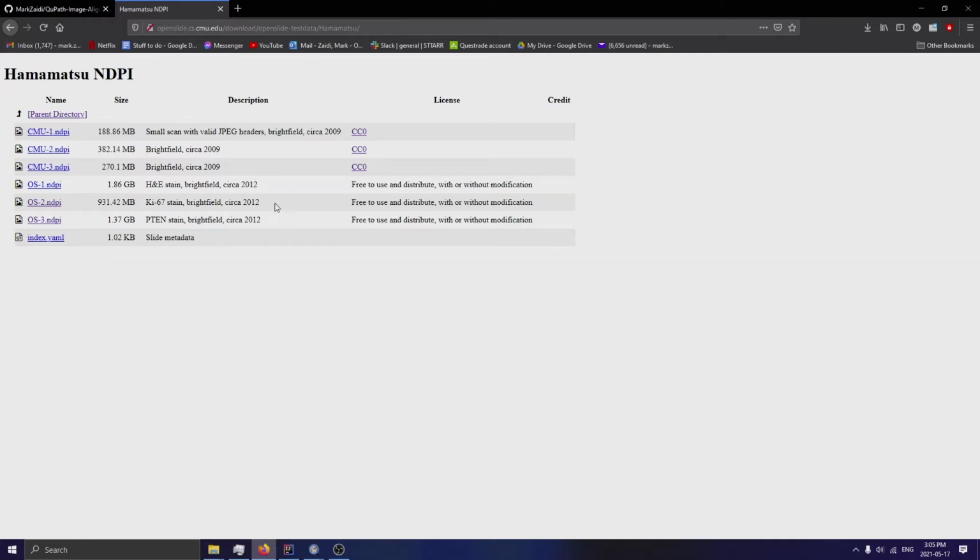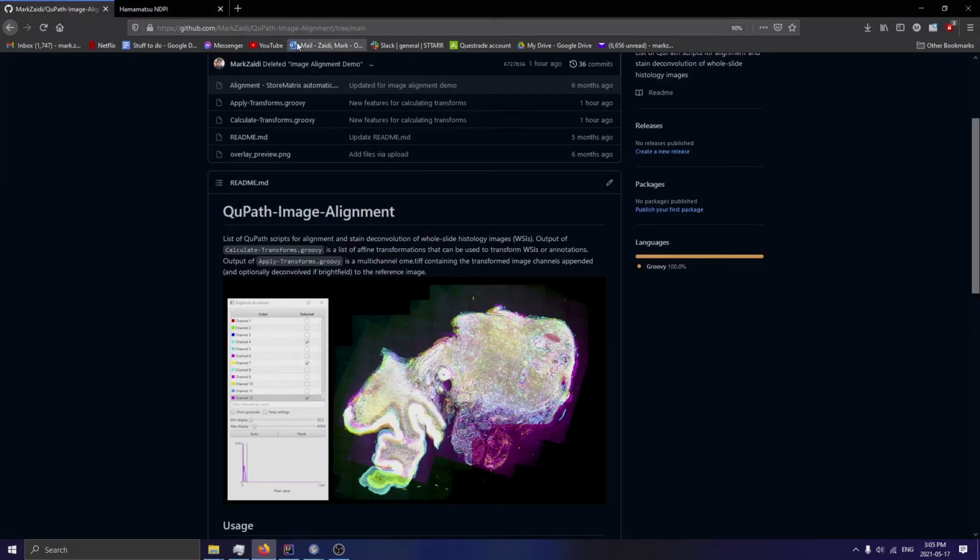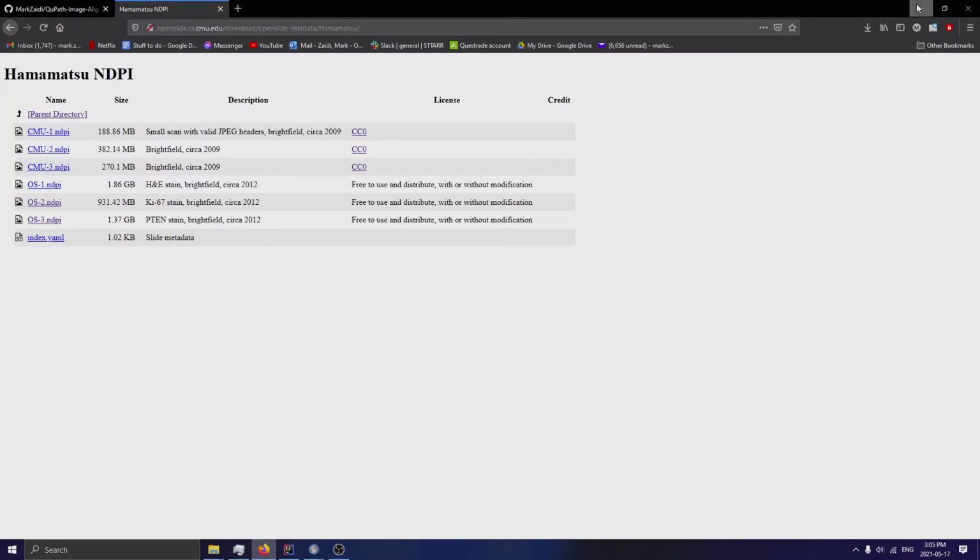Since there are several functionalities within this alignment script that allow for some manual alignments, optimization of alignment parameters, and several other settings, I'll try and go in depth to the most common features used, but there might be some that I may end up omitting. In any sense, let's get started and we'll see how this goes. So I just want to make sure we're recording.